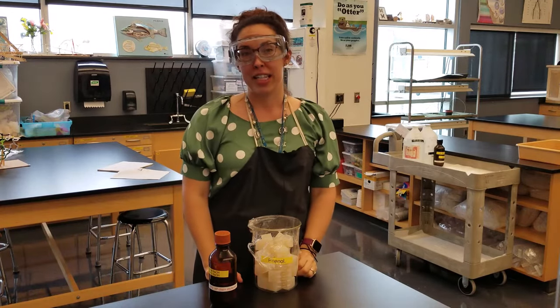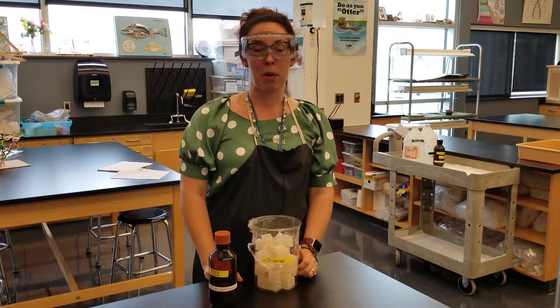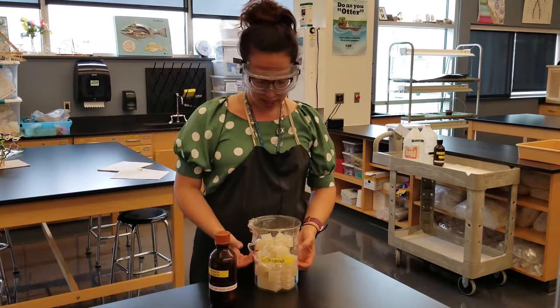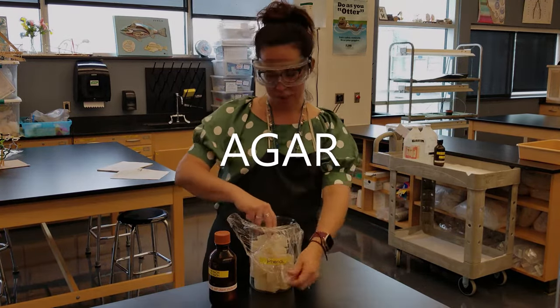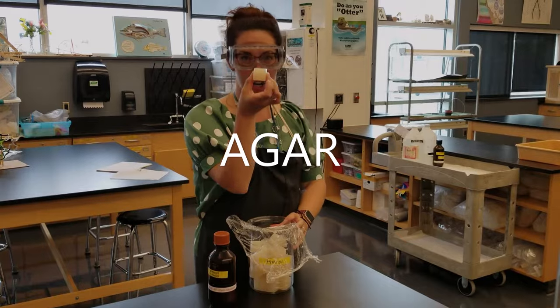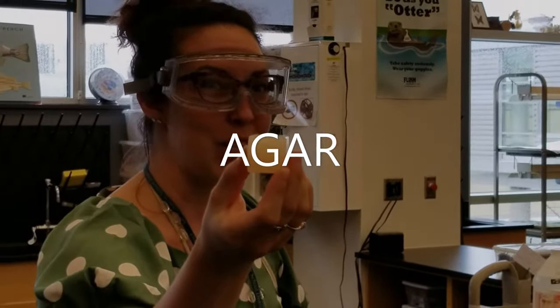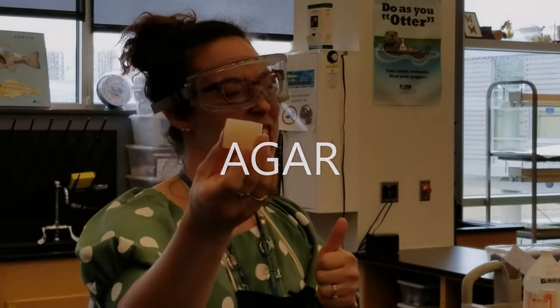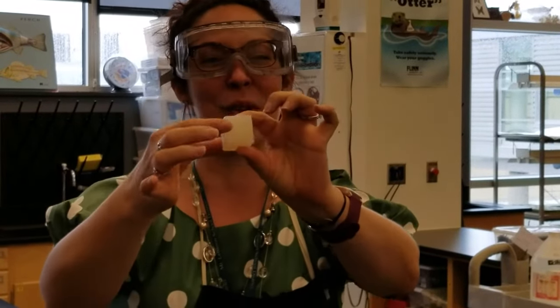Real cells are very tiny — they're microscopic. We needed to pick a substance that would work well to model the texture of a cell. Enter agar. Agar is a rock star in the biology lab. It's powdered seaweed that you mix with water, heat up, pour into a mold, and you can make any shape you want, like this teensy tiny little cube.